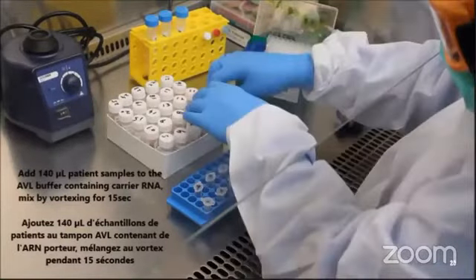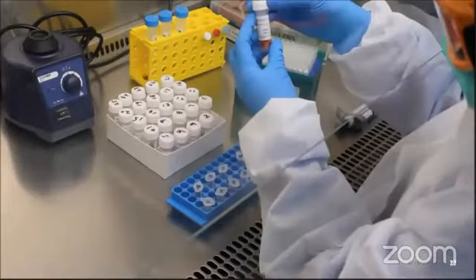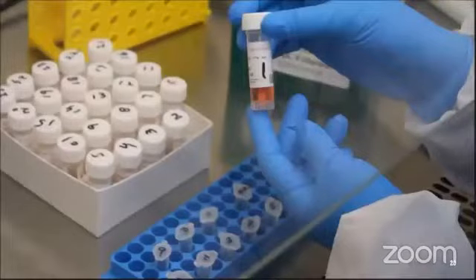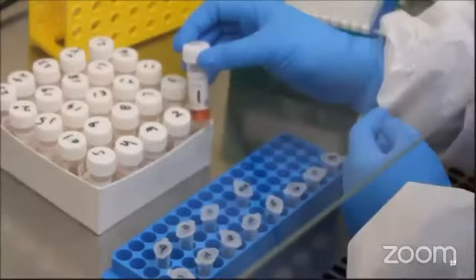Now, after the addition of carrier RNA and AVL, add 140 microliter of the patient's samples to the buffer containing Eppendorf tube.